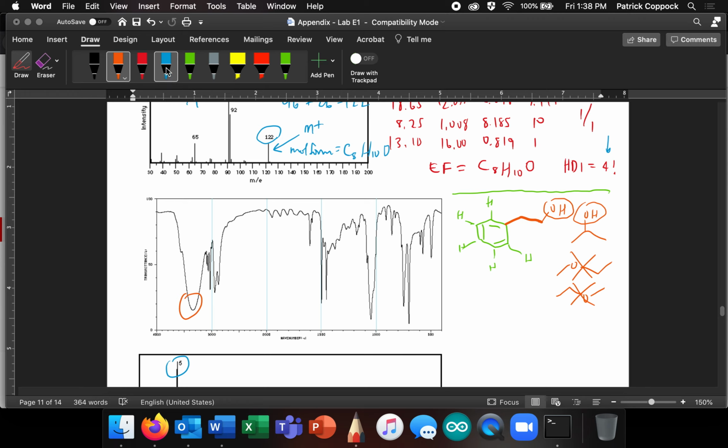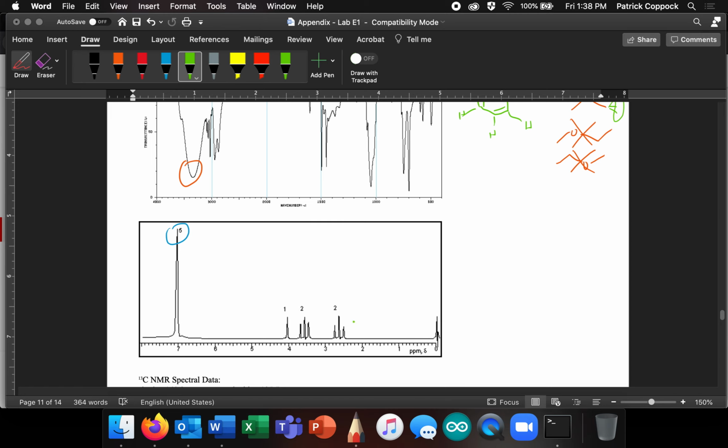Next thing I'm going to look for is, there's 4 kinds of hydrogens, right? Do I have 4 signals? Oh, there's a hydrogen there. Yeah, there's actually going to be 4 kinds of hydrogens no matter what I do, right? So there's another one, right? There's 4 kinds in both of these, okay? So I should have 4 signals. Let's look down here. And I do, 4 signals, okay?